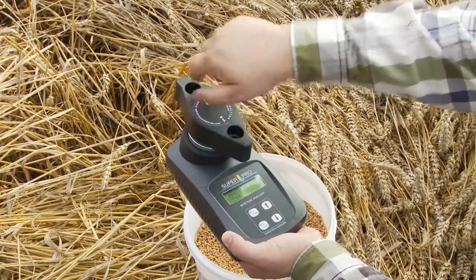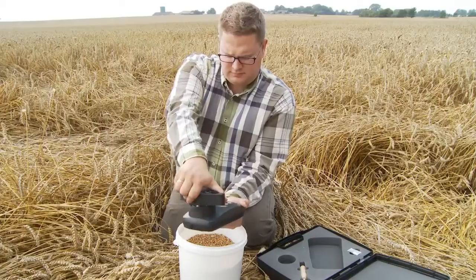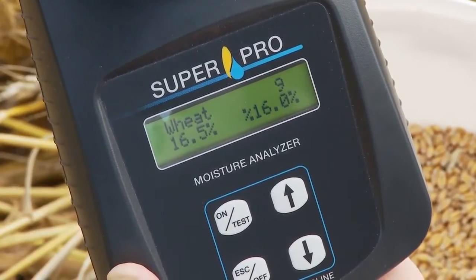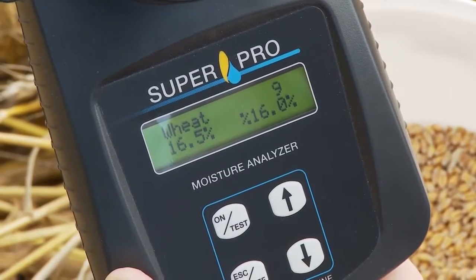Pour the sample into the grinder, turn the handle to grind and compress the crop sample. Press the Test button and you can read the moisture content directly from the display. At the same time, you get an average value for the last four measurements done.